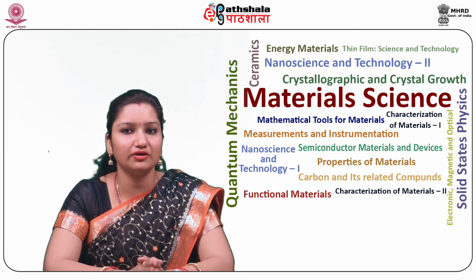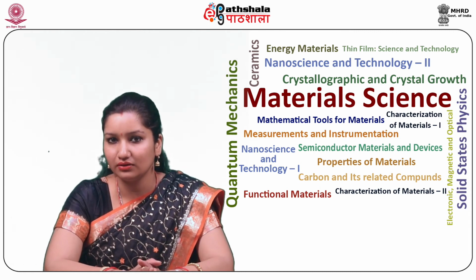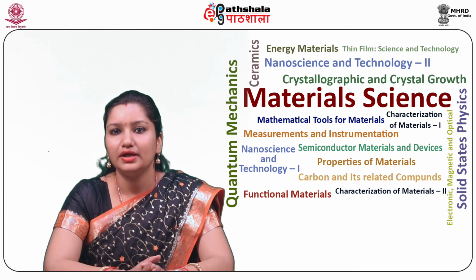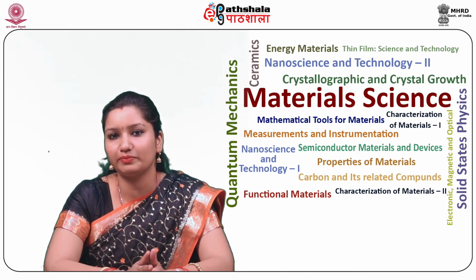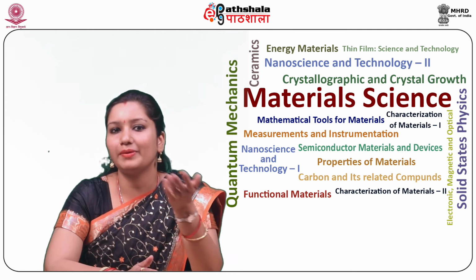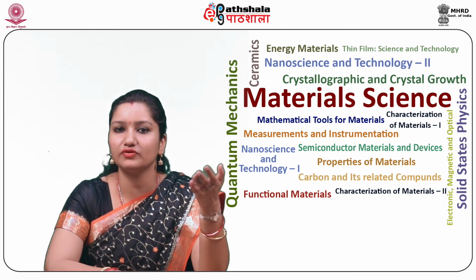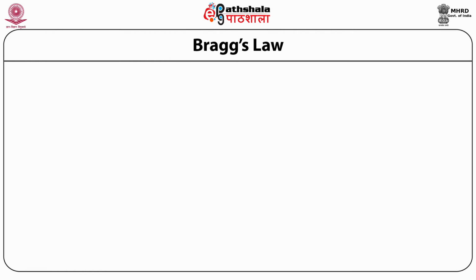Finally, in 1912, the two English physicists W.H. Bragg and W.L. Bragg analyzed Laue's experiment and successfully expressed the necessary condition for diffraction in a simple form, known as Bragg's law, after the physicists who proposed it. Now let's discuss the most important Bragg's law.